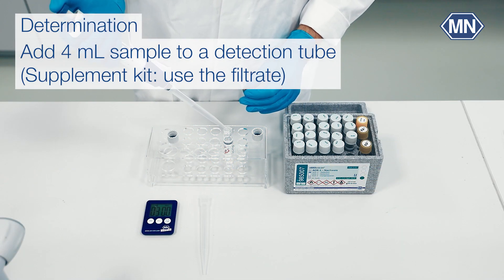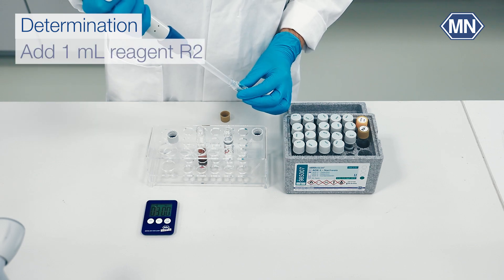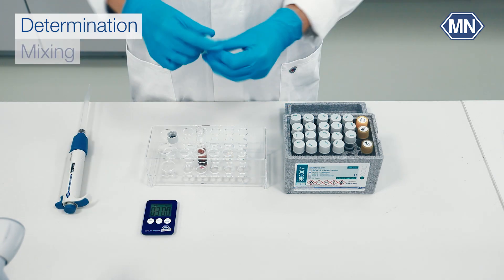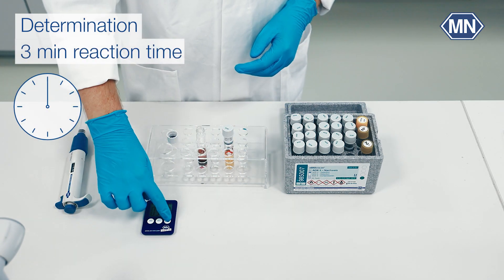For the AOX determination, take a tube from the detector box and fill it with 4 ml of the sample. Add 1 ml of reagent chloride R2 to the tube and seal it tightly. Then shake the mixture. Allow a reaction time of 3 minutes.